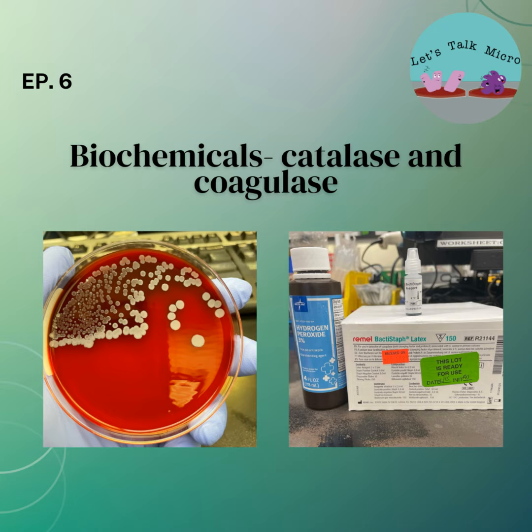Typically, we look at them after they have been incubating for 18 to 24 hours. We examine the agar and determine if there's growth or not. Then we also determine if it's pathogenic or not. This is based on the source. Like I had mentioned before, we have bacteria in our bodies. In some areas, they are normal flora. Take, for example, E. coli. It's a gram-negative rod, part of the Enterobacterales, formerly known as Enterobacteriaceae. But if you have it in the urine, it's pathogenic, right?